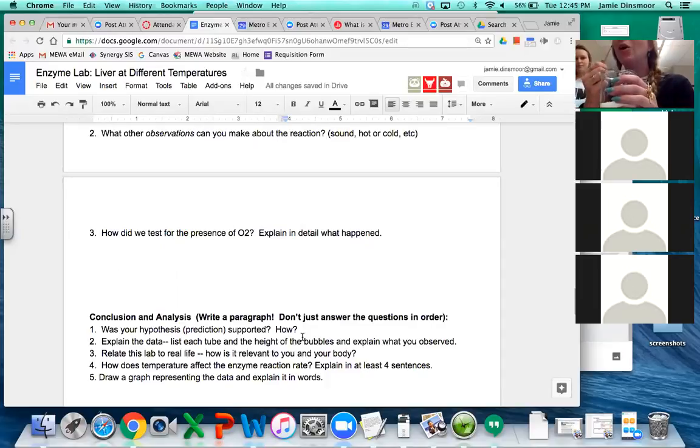All right, trying again. The key is to get that ember. Oops, and I just touched it. That doesn't work. Let's try the toothpick. Come on. All right. I told you, 80% success rate. These are also different tools than I usually have, so. Whoa.